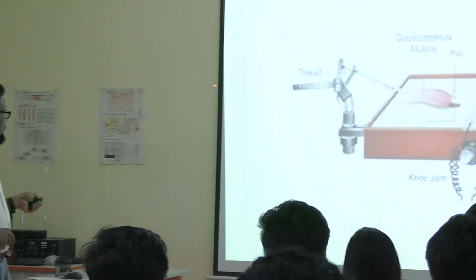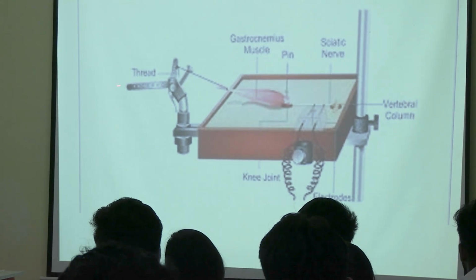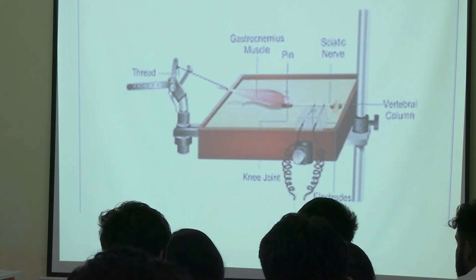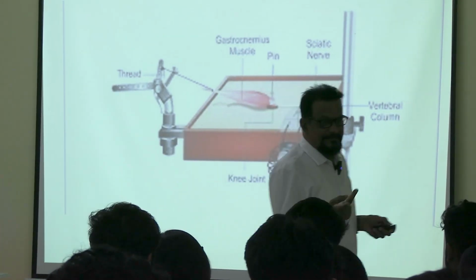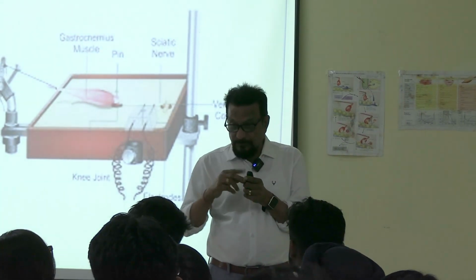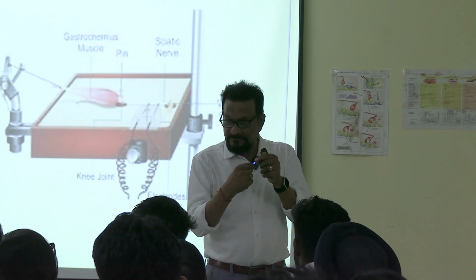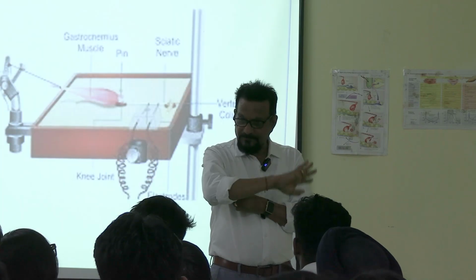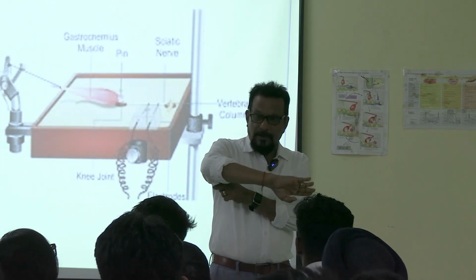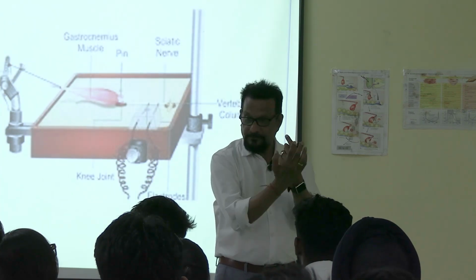The long stick is attached at one end to it, and the other end has a writing device. Normally it is X-ray film, cut into an arrow shape and attached to the other end of the stick. So now it is the writing device. When the stick moves, it will write on the surface of the kymograph.